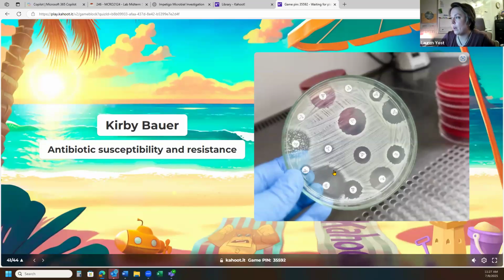Zone of inhibition, you measure it all the way across the whole diameter in millimeters. The larger the zone of inhibition, the more you inhibited, even at lower concentrations. So you get lower and lower the further away you go. If we look at CIP, is there still CIP, ciprofloxacin antibiotic out here? Yes.